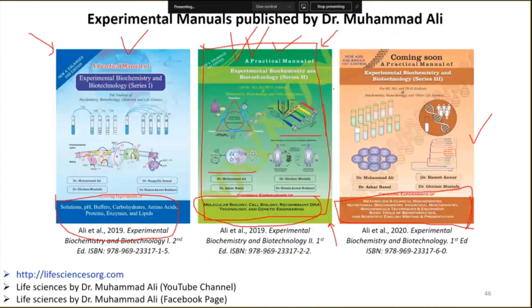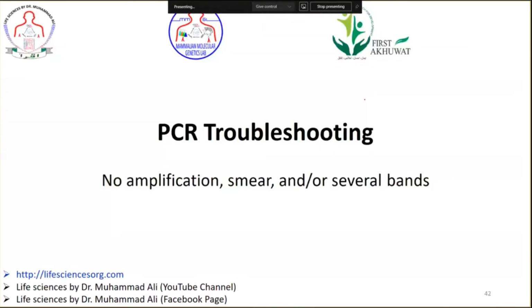In silico is the first step before we move to the wet lab. Only dry lab is not going to give us much benefit until we perform it in the wet lab. And one more thing, dry lab is not always confirmatory. It's not 100%. It's like 80%, 90%, 95%, 98% confirmatory.